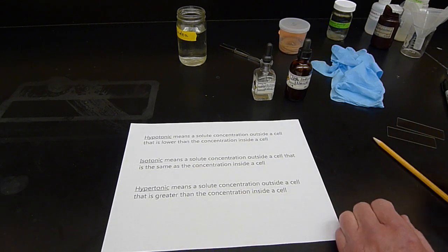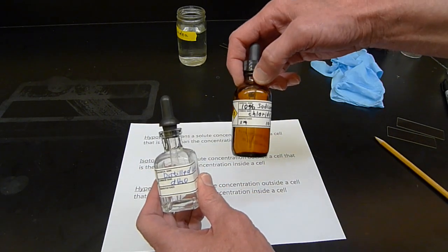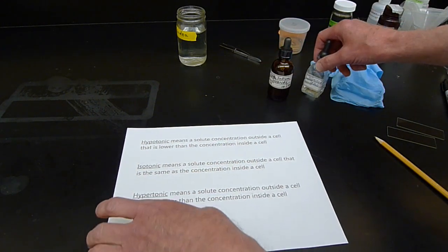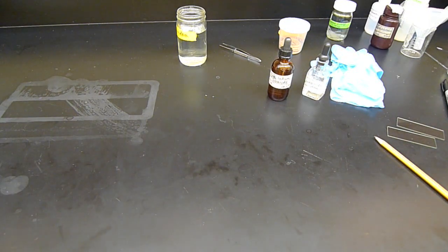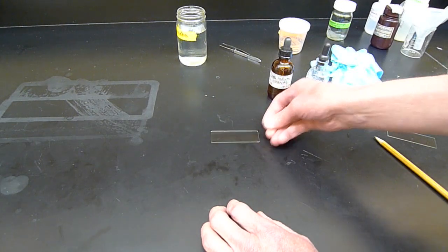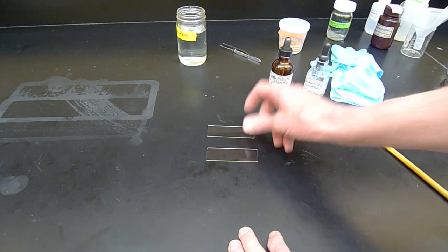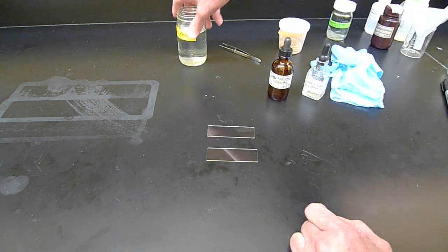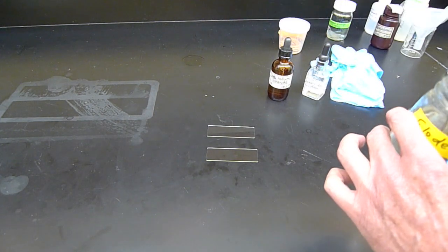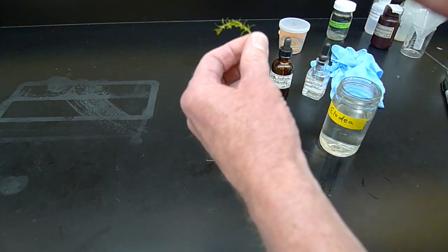Okay, so I'm going to use two different concentrations of sodium chloride. This one's going to be 0 because it's just distilled water. This one's fairly high concentration. It's 10% sodium chloride, 10% by weight. So in other words, if you've got 100 grams of solution, 10 grams of that 100 is sodium chloride. Fairly high concentration. So I'm going to put this elodea on these microscope slides. We're going to take a look at them in a microscope. We've got a camera in one of the oculars on a microscope, and so I can show you photographs. Hopefully I'll show you a photograph of what these leaves look like when they're in these particular conditions.